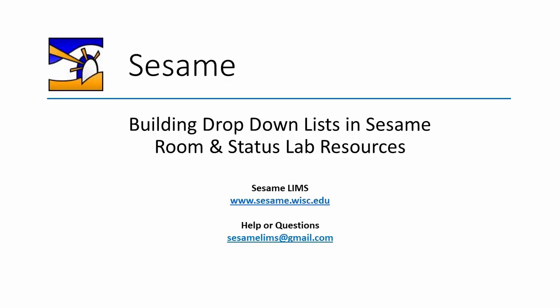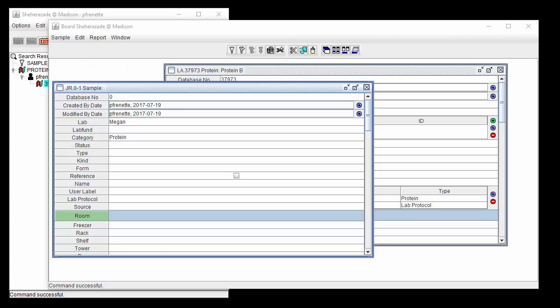Hello, and welcome to this video tutorial about building drop-down lists in the Room and Status Lab resources. In Sesame, views provide simplified graphic user interfaces for data entry and retrieval.